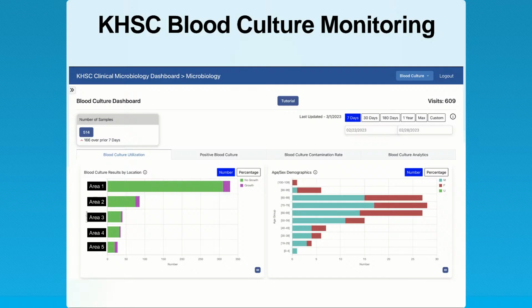And so that tells you what the epidemiology is on a very basic level. This is last 7 days. If you clicked on last 30, it would re-evaluate the entire process and show you 30 days of data. You can go up to a year. You can go to max. If you hit max, I think you get close to 600,000 samples. So quite a massive data set, and you can do this analysis at any time. If you click on the M for male, it gets rid of all the males and just shows you the number of females. Again, you have numbers, you can convert it to percentages, and all of this gets done seamlessly.